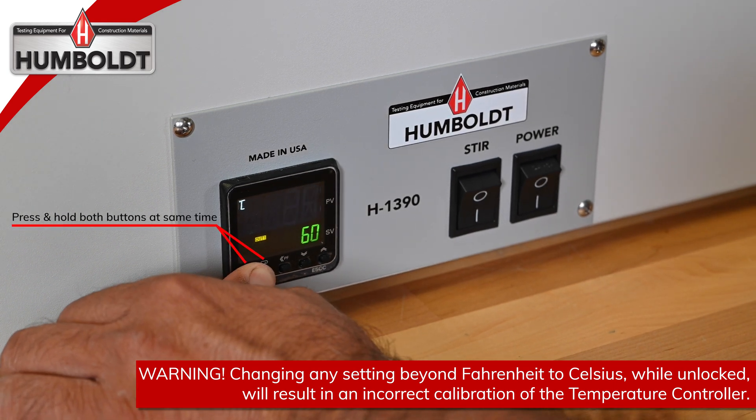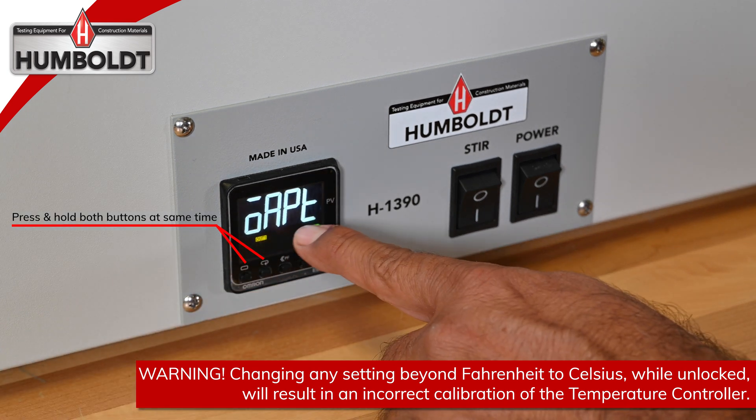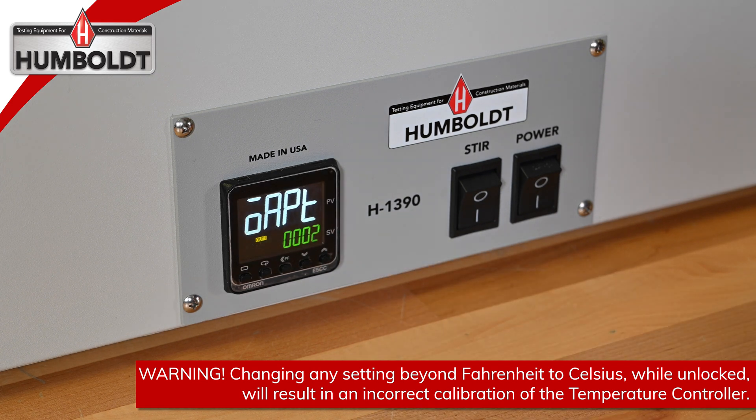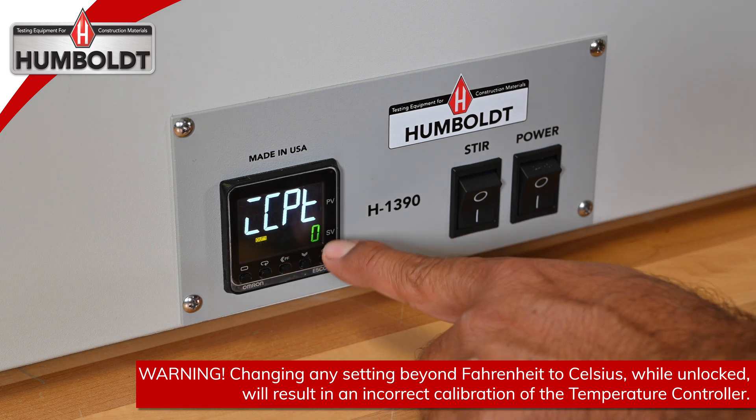Press and hold the first two buttons until the controller shows OAPT with a setting of 0. Using the up arrow, change the 0 to 2. Push the second button and the display will now read CCPT with a setting of 0.